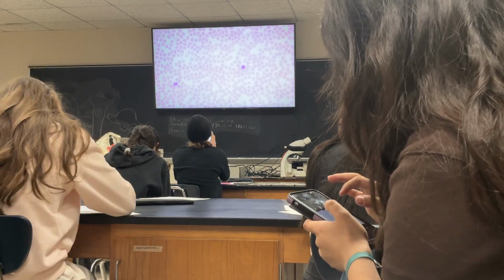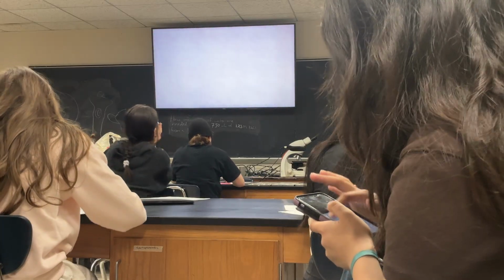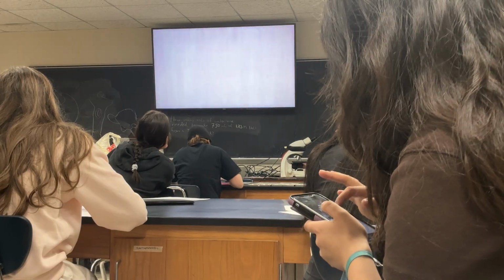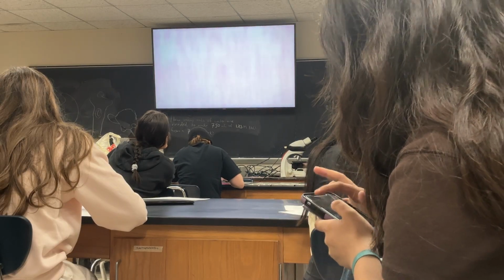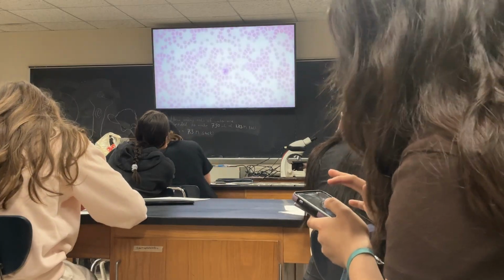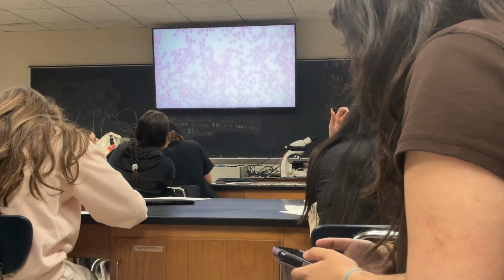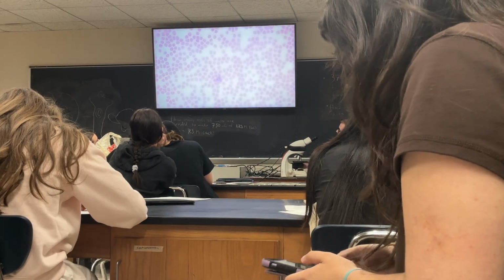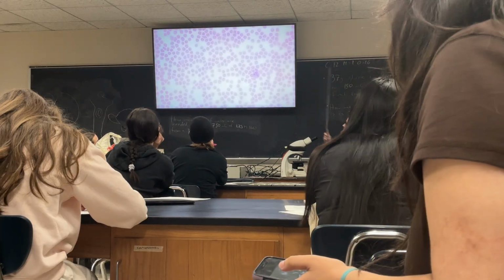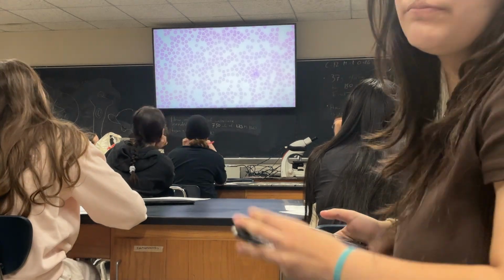Whenever you do a drawing, I would draw a nucleus in all the cells that are white blood cells, and no nucleus in red blood cells. Those white blood cells might look kind of weird though, depending on the slide that I grab. But as long as you see purple and not just pink, it's a white blood cell. This guy is kind of weird, it's like an eosinophil, or no, it's not, it's a neutrophil. Even this guy, it's not super clear, but maybe that's the only one I can find. And there's just enough dark purple to tell you there's a nucleus there, that's another neutrophil. Okay, questions on any of the stuff?